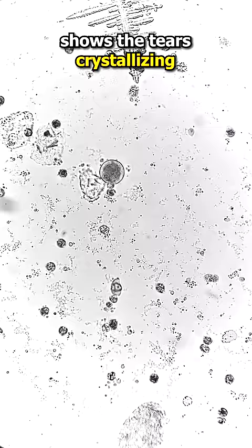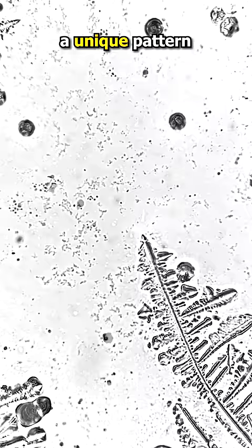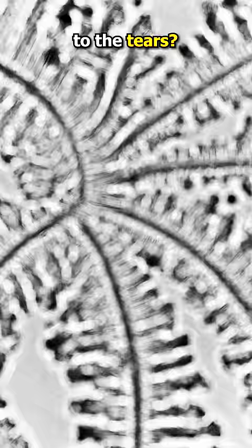The footage here shows the tear crystallizing out in real time. Each tear forms a unique pattern, but what happens if you apply polarizing light to the tears? Have a look at this.